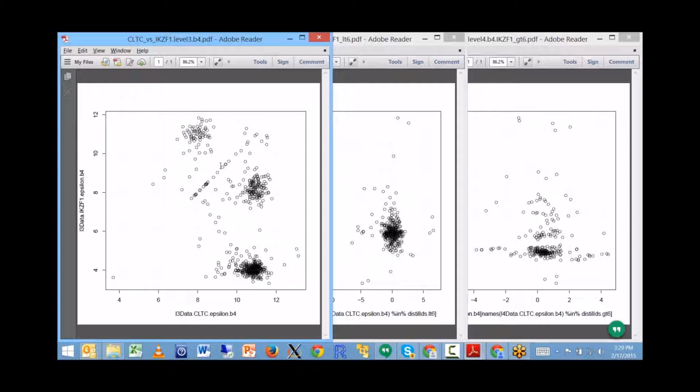But they are forcefully, by the algorithm, split into two different measurements, because that's what the algorithm does. It takes measurements that it has observed and tries to split them in two clusters that are approximately 2 to 1 in terms of numbers of measurements in the cluster.